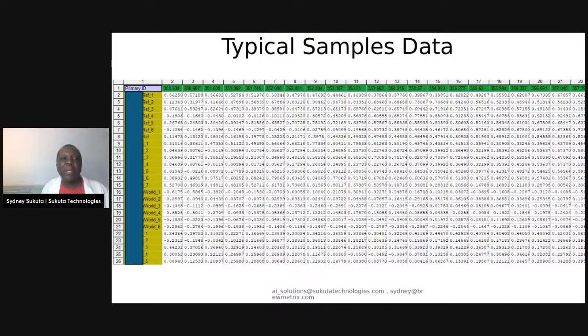So this is a typical sample data I get. These are the samples. I took off the names of the samples because some of these companies, you may recognize them. And these are the wavelengths. For example, for this sample, I scanned it 6 times and got a spectrum. Another one 7 times, I got a spectrum, and so on. So this data is a gold mine of information. We will interrogate this data and get the information or the diagnostics we need.